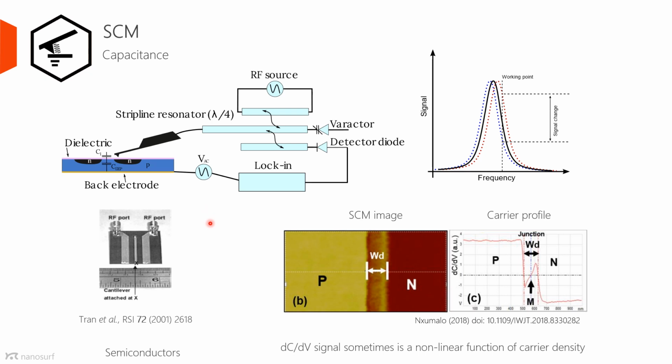However, in semiconductors, there is the so-called depletion capacitance, which depends on the carrier density, and this can be changed in large ranges by varying dopant levels or gate voltages, and this one would give a detectable contrast in scanning capacitance measurement. The experiment design is rather old.